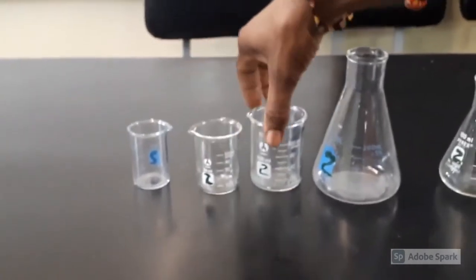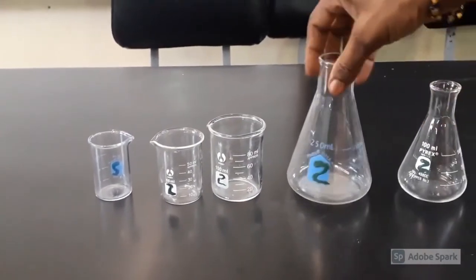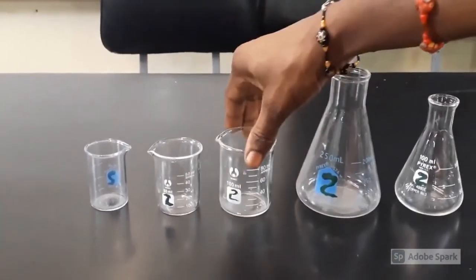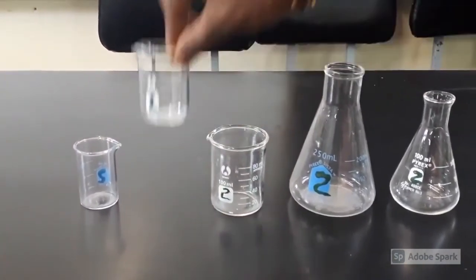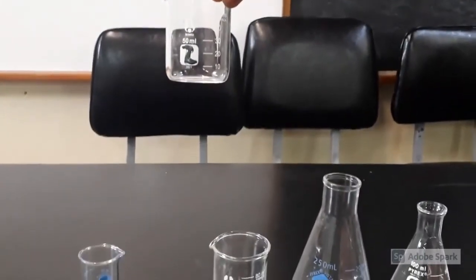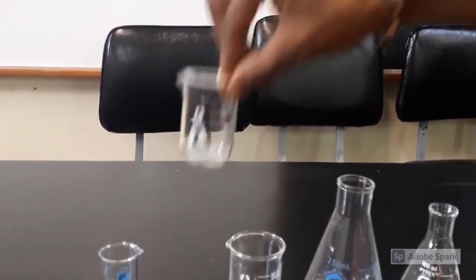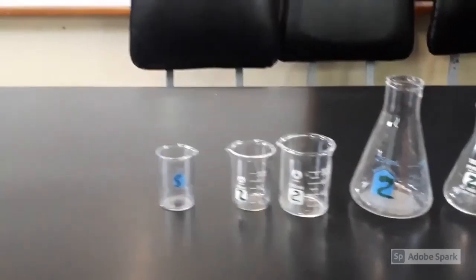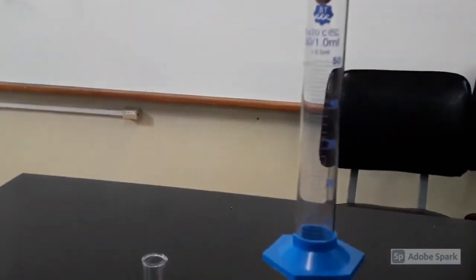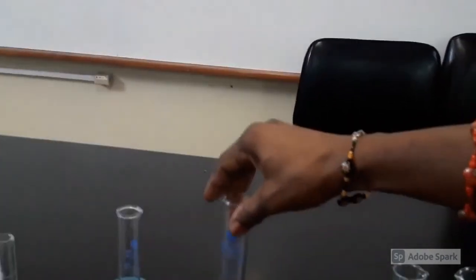Beakers and Erlenmeyer flask, they are non-volumetric. Even though there's calibration on them, they are just used for holding the liquid, so we are not using them for measuring. That is why we classify them as non-volumetric. So this is just 50 mil, it says it can hold approximately 50 mil, but it's not meant for measuring 50 mil. If we have to measure a 50 mil liquid, we use a measuring cylinder. This is a 50 mil measuring cylinder.